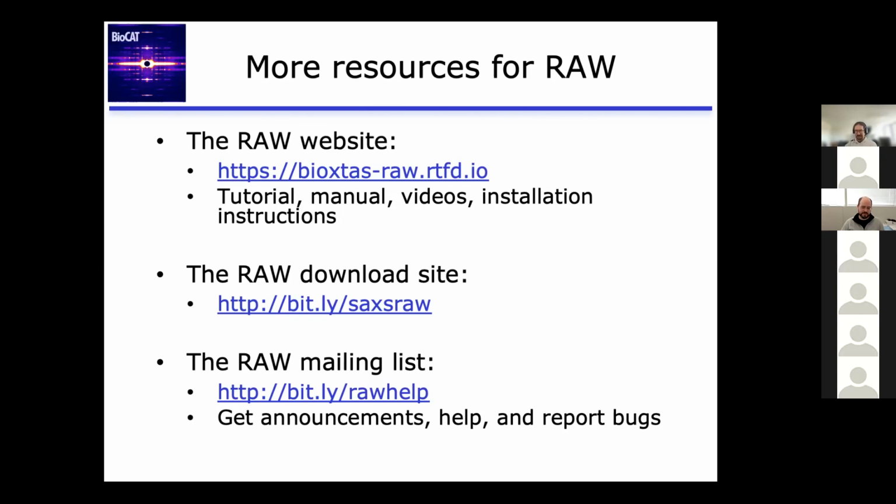Yeah. All right. I think one other question, and this may be our last one unless more come in. So you mentioned early on that SAXS is most powerful when it's being used in combination with other techniques. What's your impression of SAXS and how it's impacting the AlphaFold 2 and RoseTTAFold improvements with structure prediction?